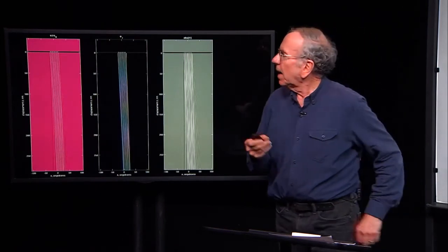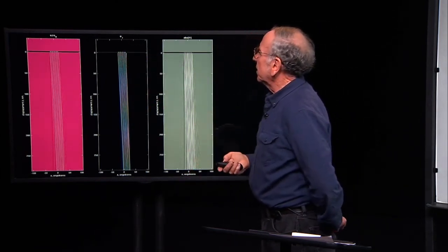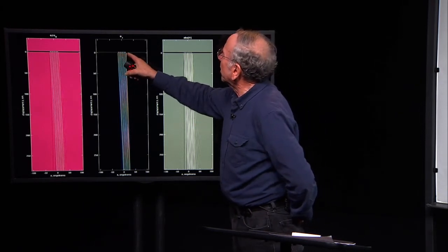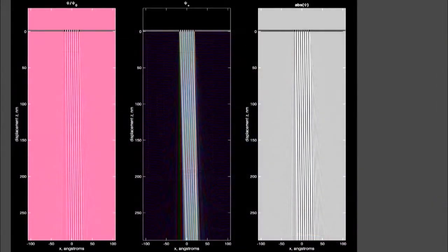Now, I told you that we get a diffracted wave. And this is exactly what the psi plus wave looks like. So here is my grating, and here are electron waves propagating at this angle theta, which is very small relative to the normal. And you can see that there is a phase variation across here as the complex numbers go through various phase values.